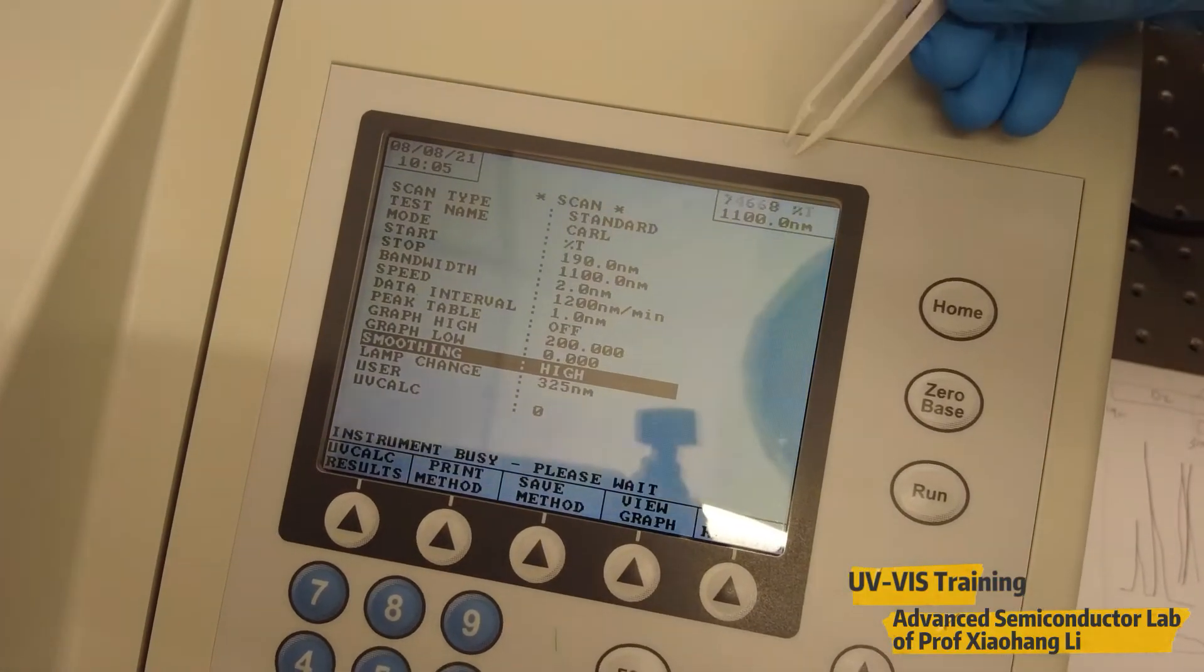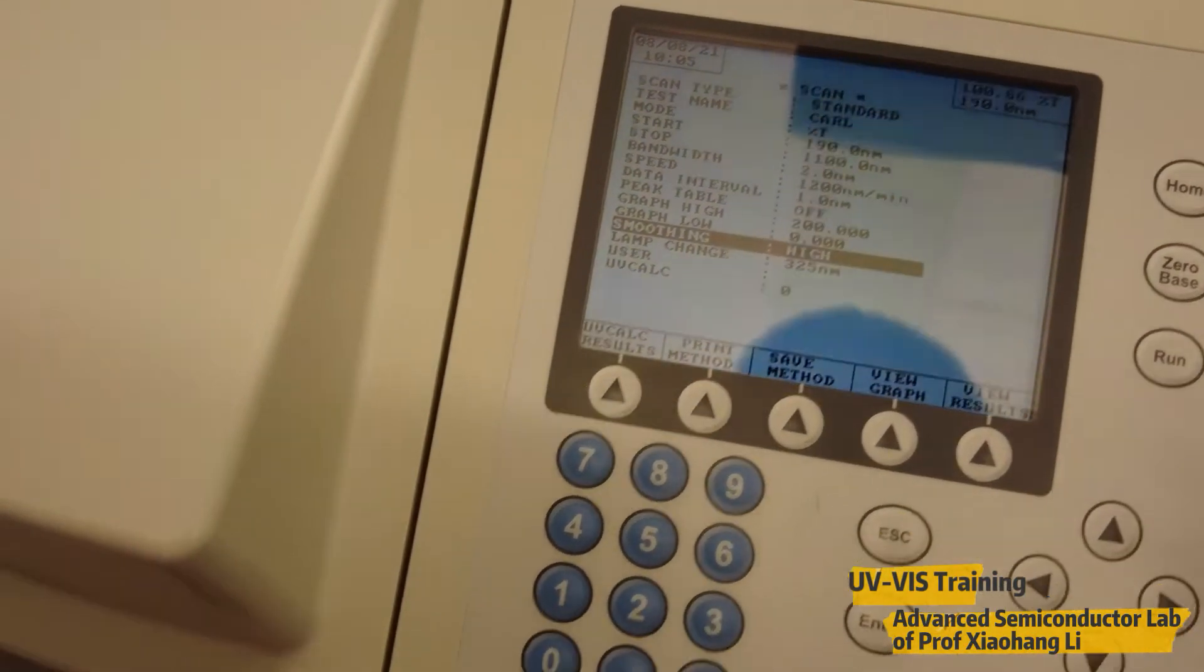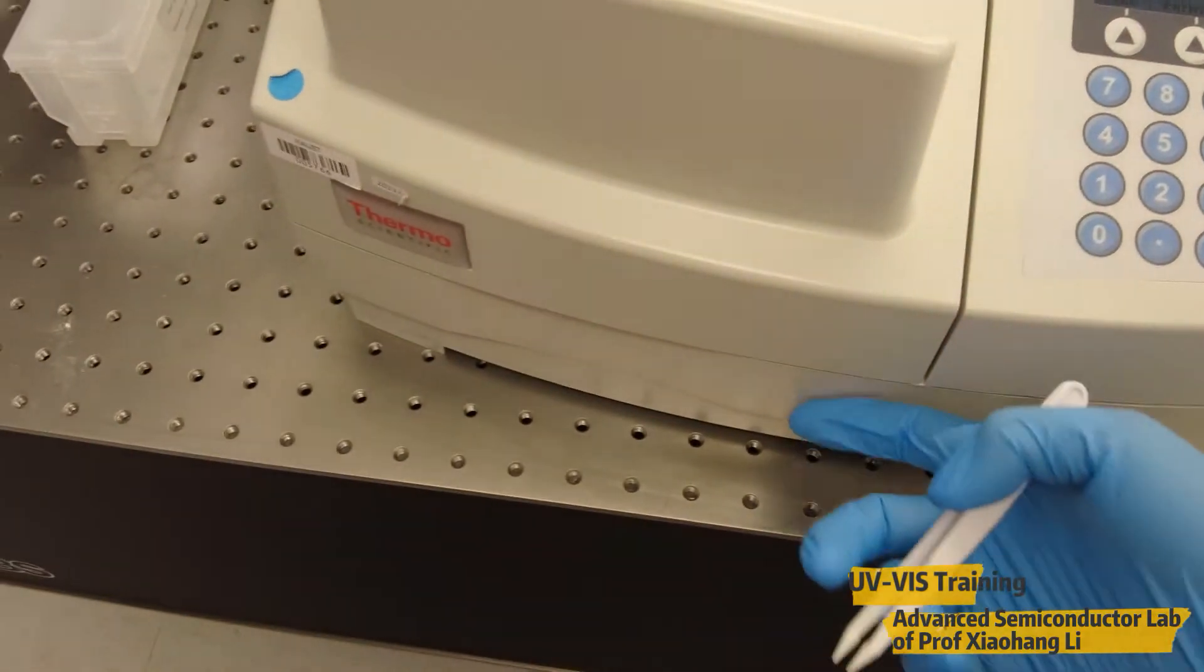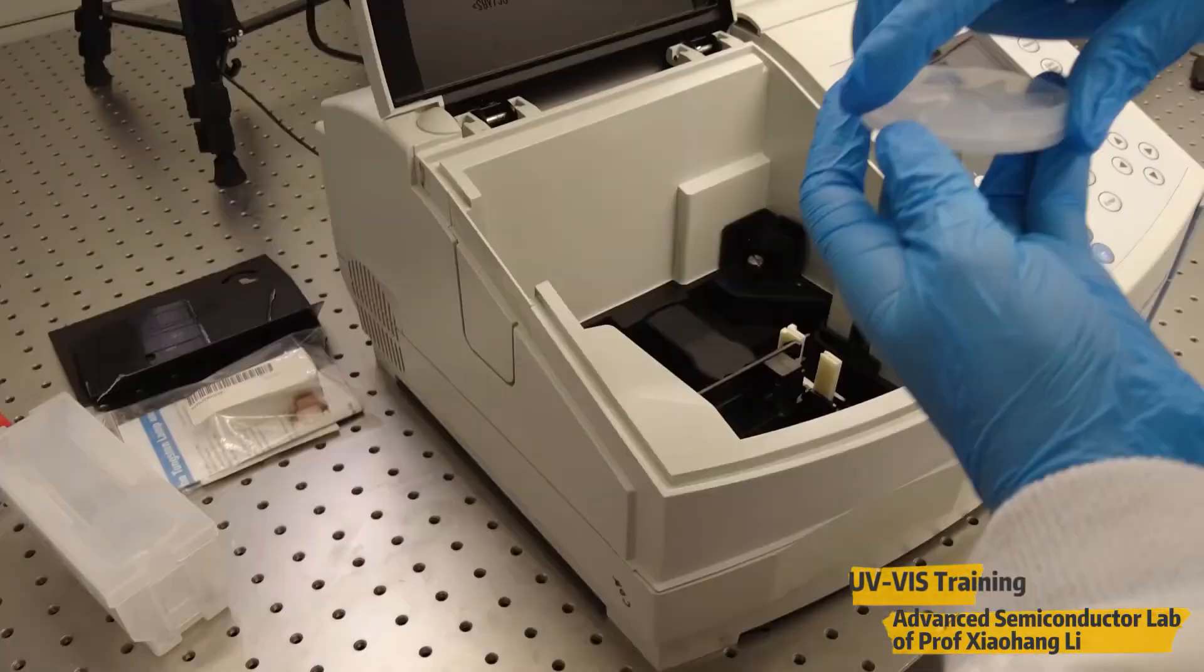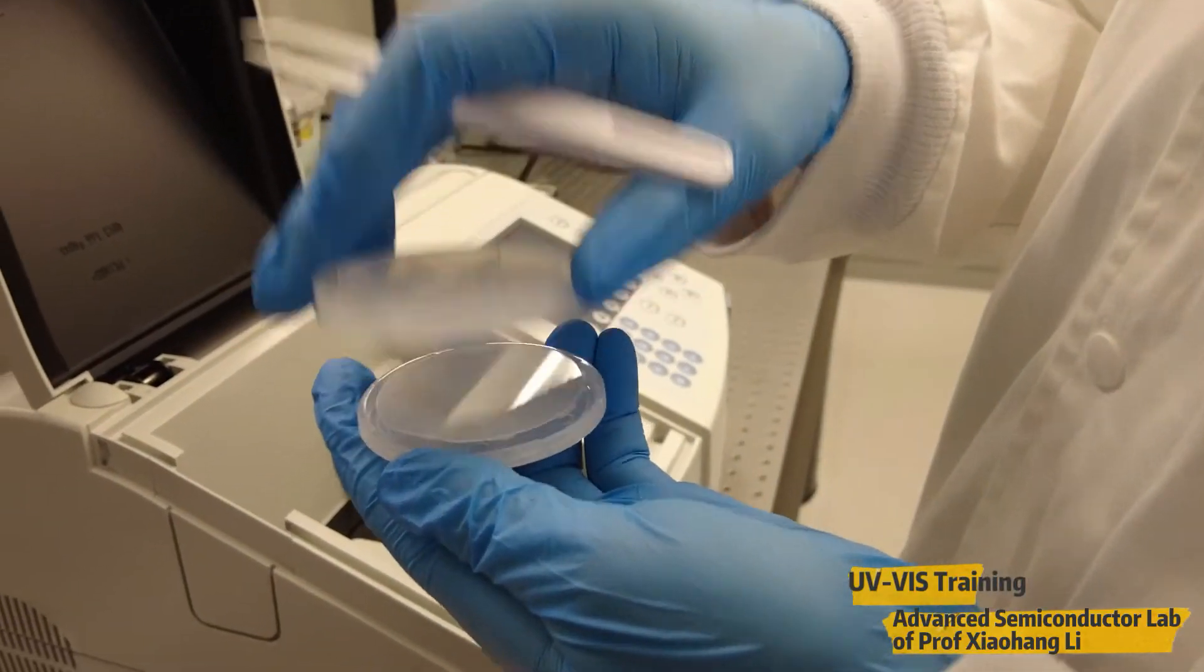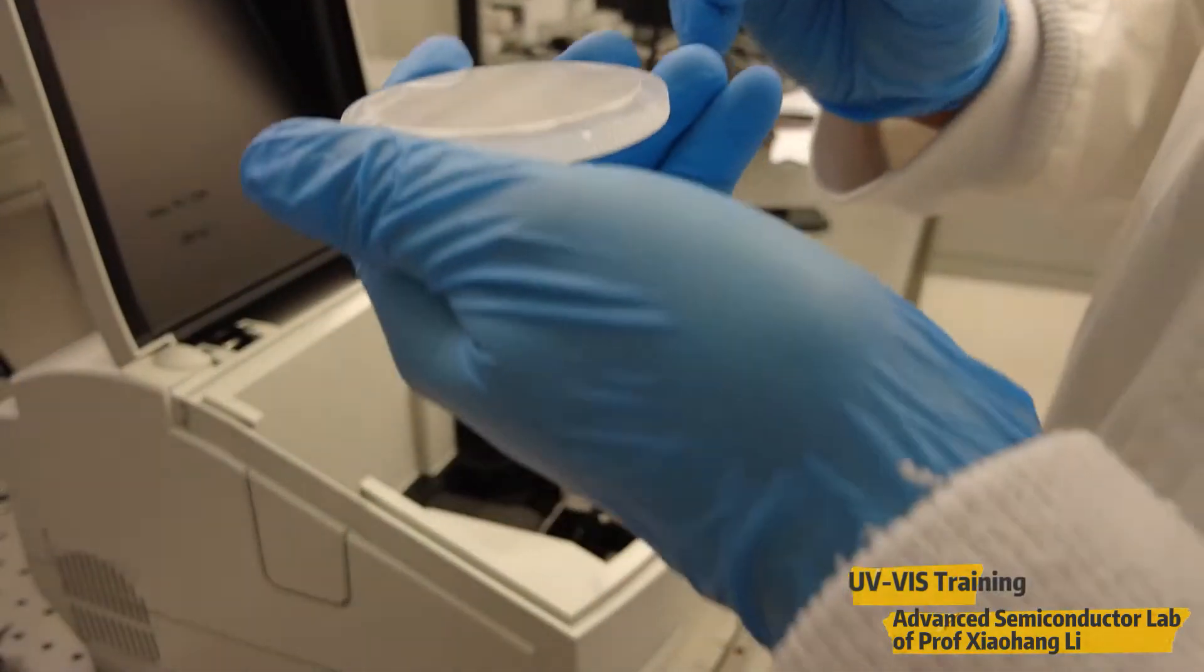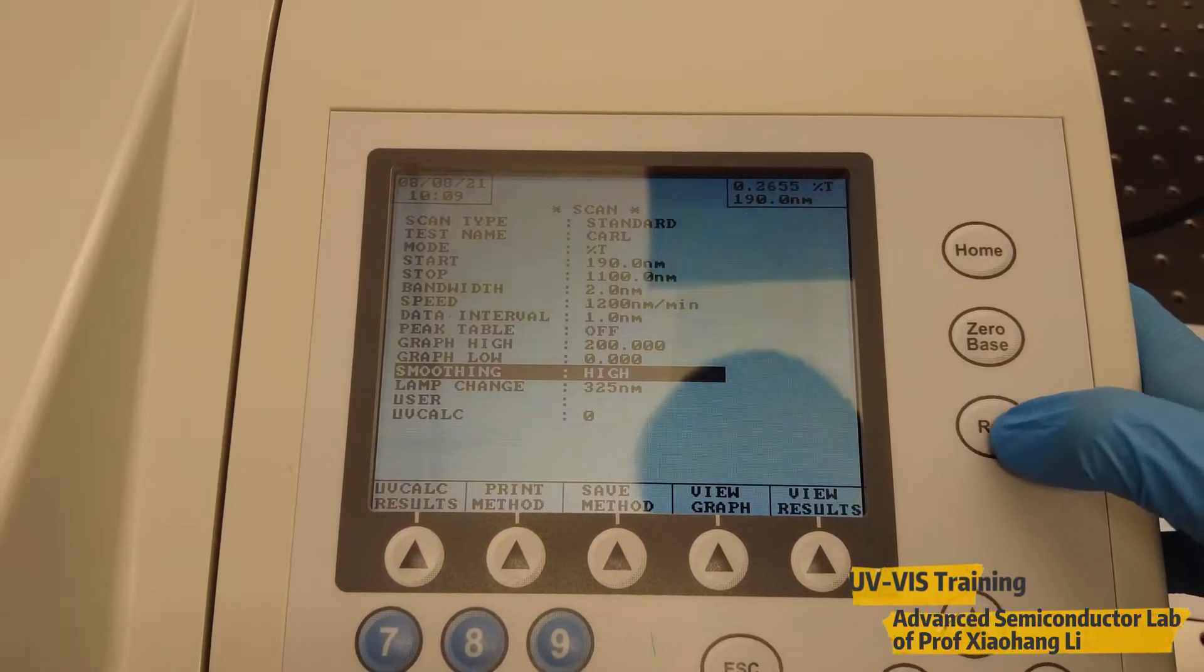As you can see it's already reached 1100 nanometer. Let's start to measure the gallium nitride. We'll take the sapphire substrate out. Then we'll put the gallium nitride film. Let's put the gallium nitride sample inside. By pressing run it will start the measurement.